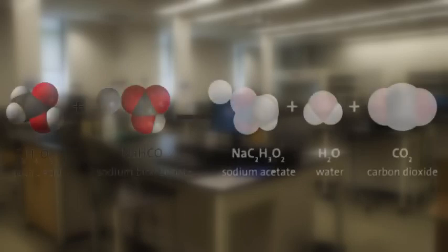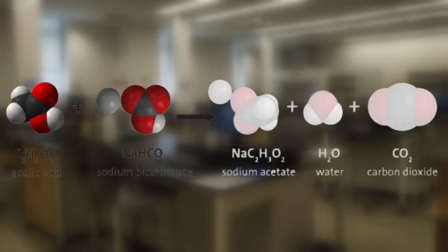Today we'll be covering something a little different. We're doing the classic sodium bicarbonate and acetic acid experiment. I will go over what the reaction is doing at the end of the video. What we're trying to find out is if adding the sodium bicarbonate first changes the reaction at all.